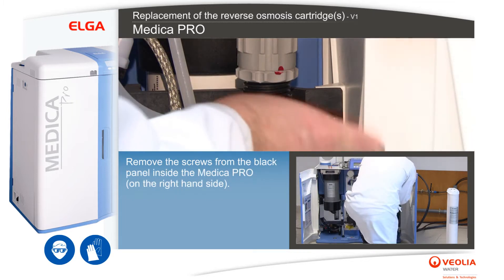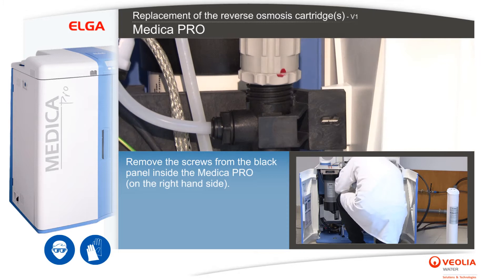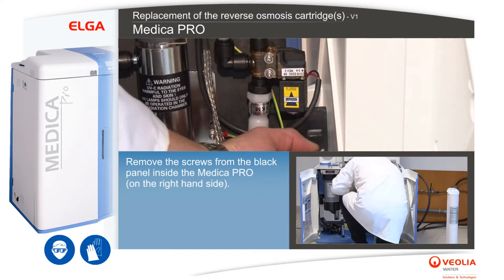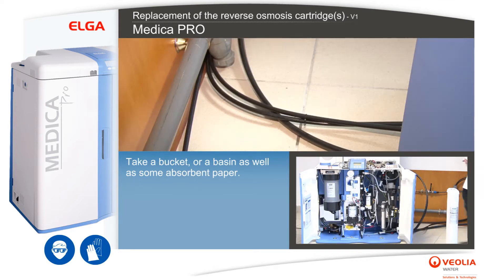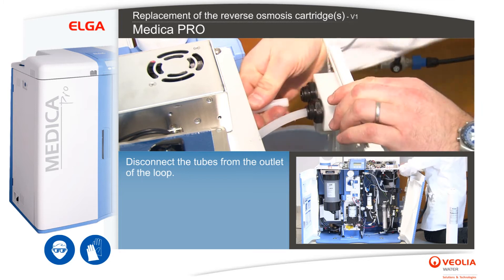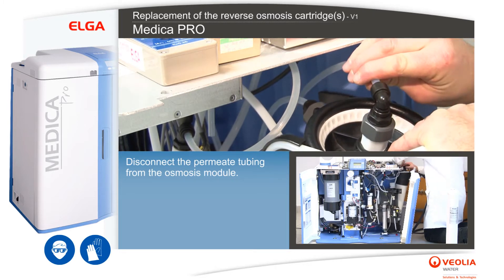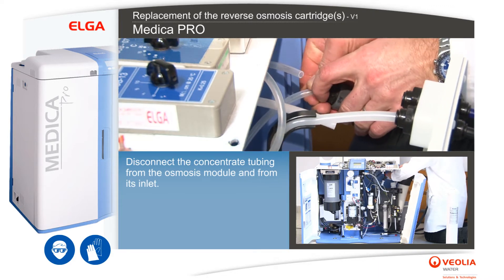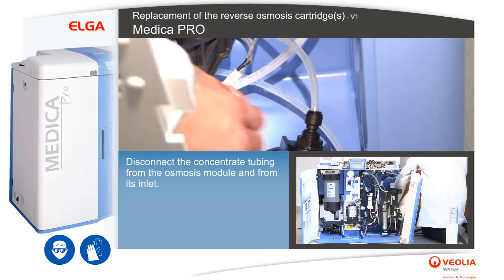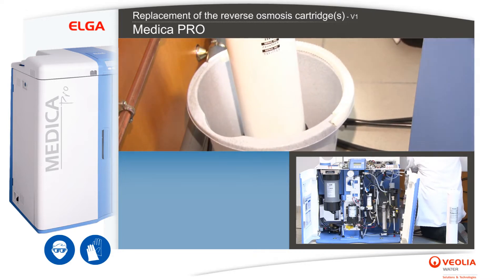Remove the screws from the black panel inside the Medica Pro on the right-hand side. Take a bucket or a basin as well as some absorbent paper. Disconnect the tubes from the outlet of the loop. Disconnect the permeate tubing from the osmosis module. Disconnect the concentrate tubing from the osmosis module and from its inlet.